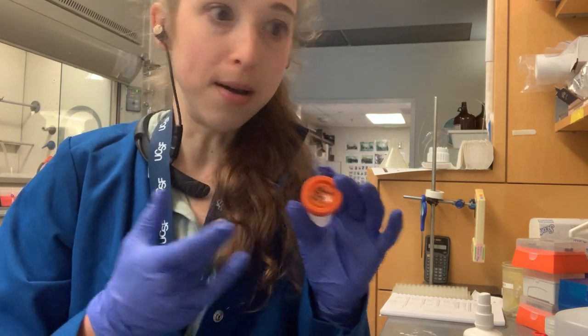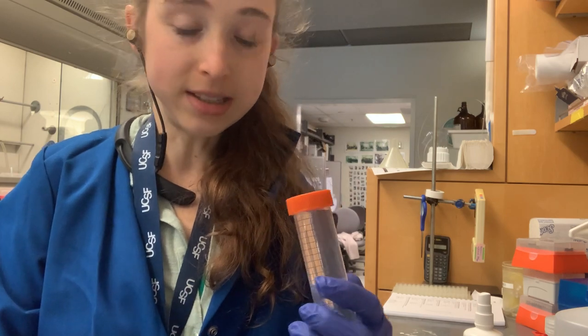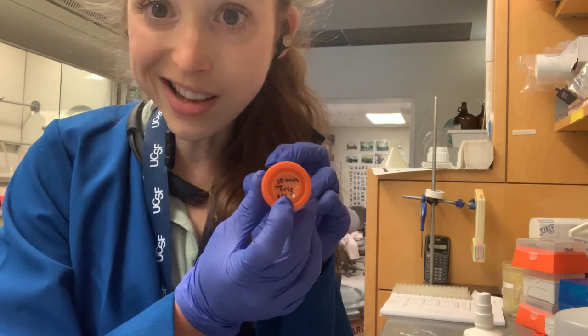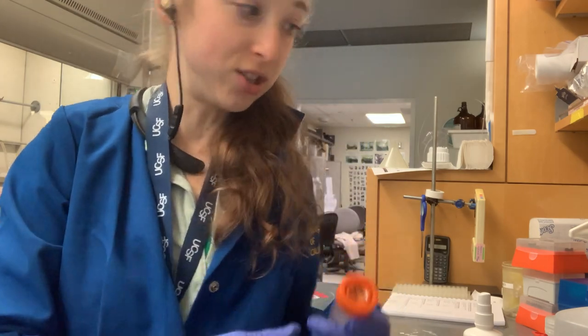You want to put the main important things on the lid — like what it is. For example, this tube of tris: I have '10 millimolar tris pH 8' on the lid because if I'm going through a rack of tubes and I want to see what's what.